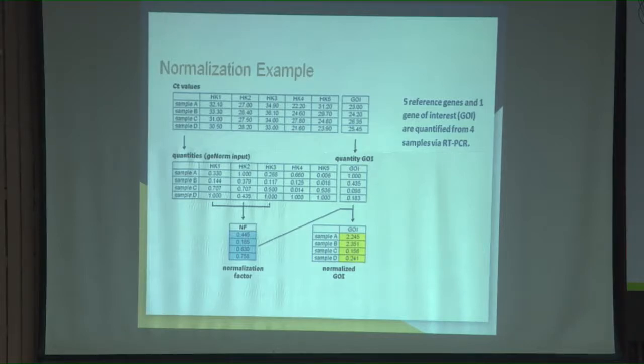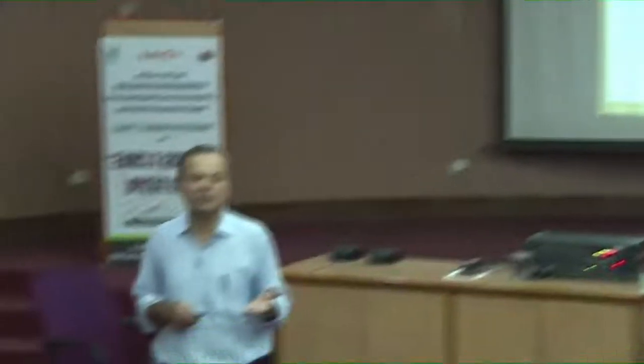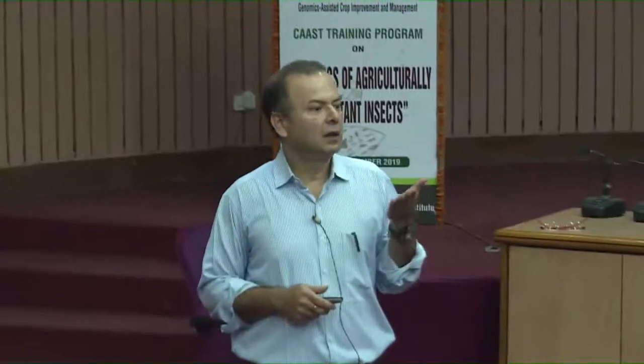Okay. So, methods are available. The important thing is to know that if you encounter a situation where you have to find a suitable normalizer, then an experiment has to be done. Okay.